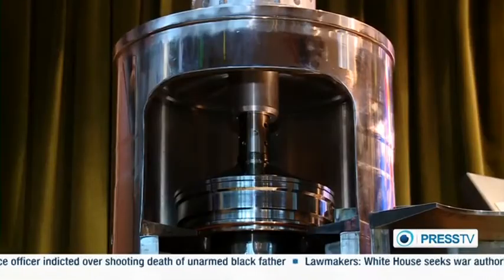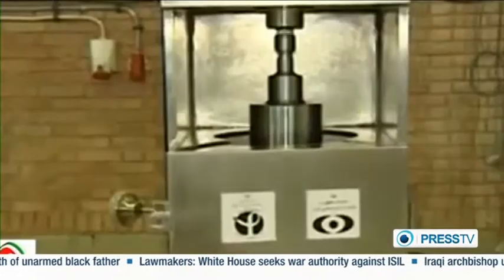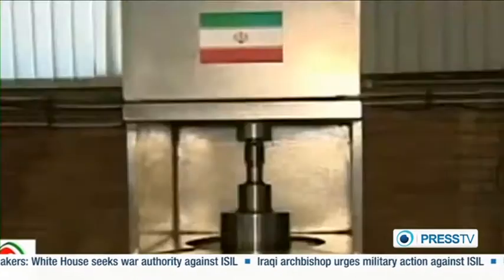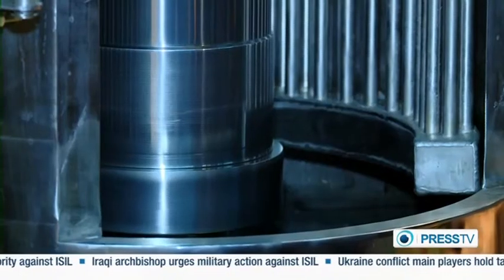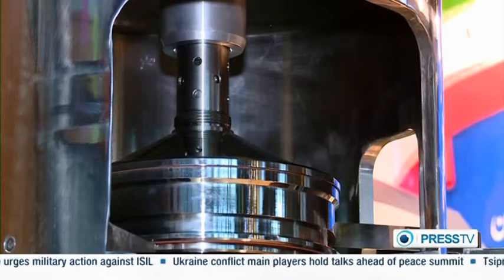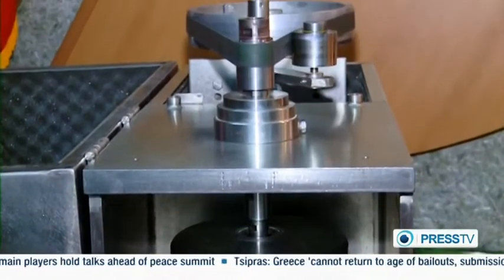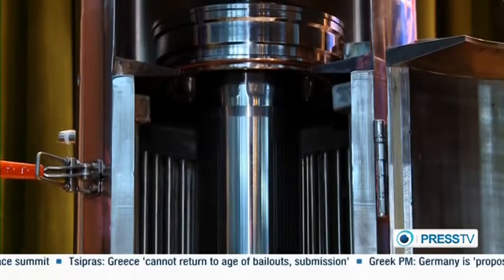All centrifuges have three main components: the sample holder, the spinning device, and the speed control. Sophisticated centrifuges may have additional features such as brakes, refrigeration and heating units, and vacuum pumps. The tubular centrifuge spins at 17,000 RPM and lacks the refrigeration unit. The head of the Atomic Energy Organization of Iran predicted that in the near future, Iran will produce more advanced versions, such as ultra-centrifuges that can spin at 100,000 RPM.